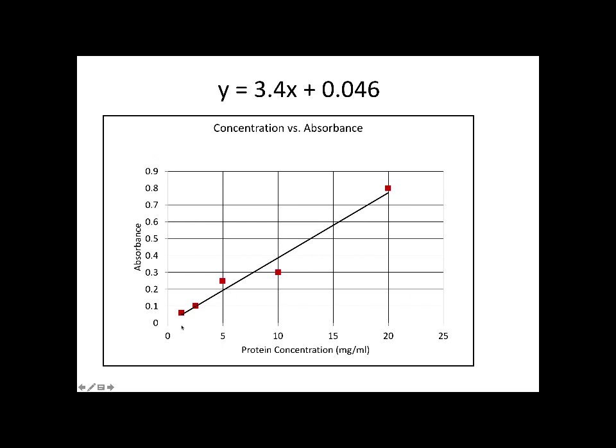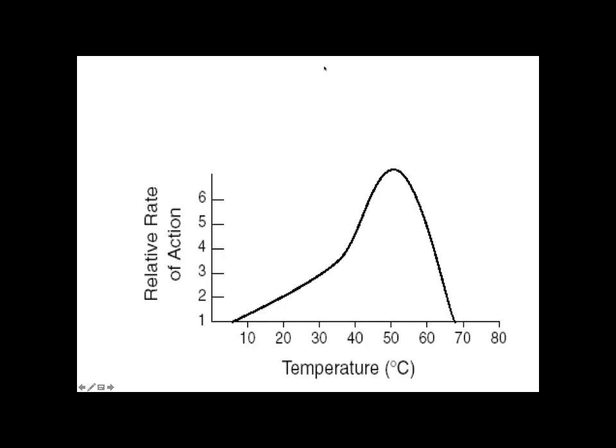Using these standards, we can then create these standard curves. In our case, it will actually be glucose concentration versus absorbance, but you get the same thing, concentration versus absorbance. And from this, you can then get an equation of a line, and you can use that equation to figure out an unknown's exact concentration of glucose. Make sure that you know how to calculate the concentration of an unknown solution using both the approximation method and the equation of a line.